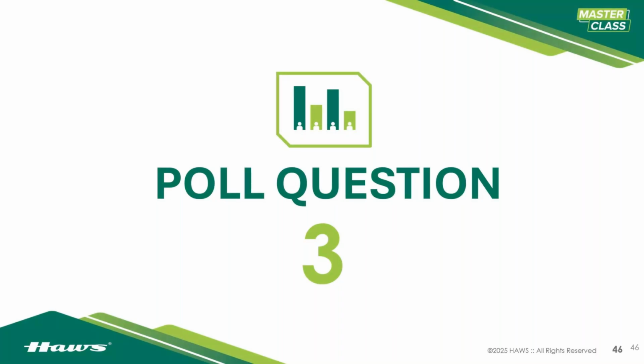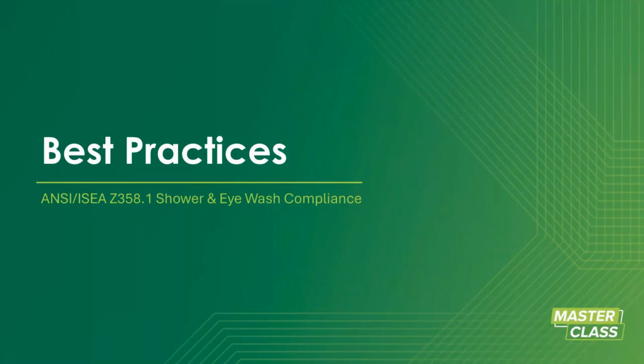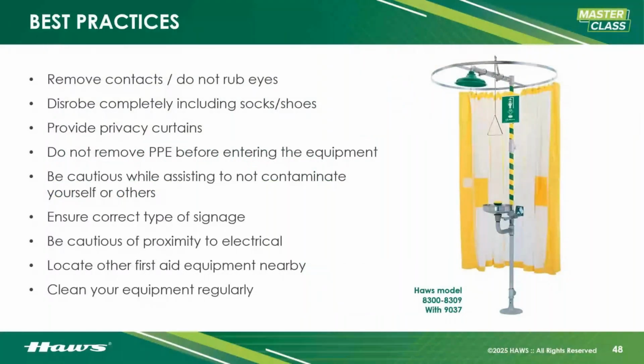Now, a couple best practices, just a couple reminders. Remove your contacts. If you have contacts in, get them out, even if you're risking potential cross-contamination from your face to your hands. You do not want those fusing to your eyeball, and once the eye wash hits your eyeball, it may push those contacts and trap contaminants in the back of your eye. You don't want that.